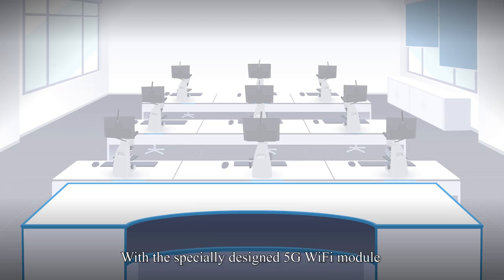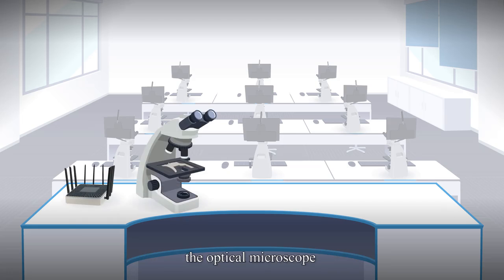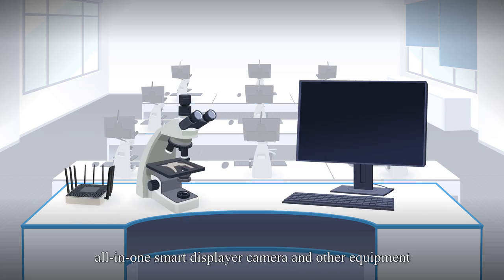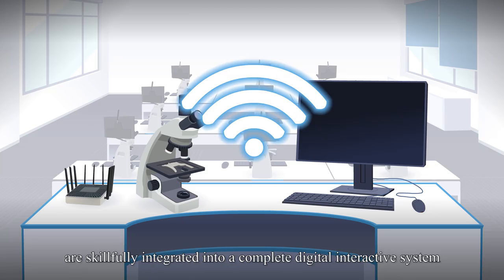With the specially designed 5G Wi-Fi module, the optical microscope, digital camera, PC, all-in-one smart display or camera, and other equipment are skillfully integrated into a complete digital interactive system.